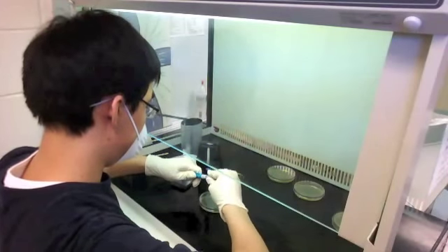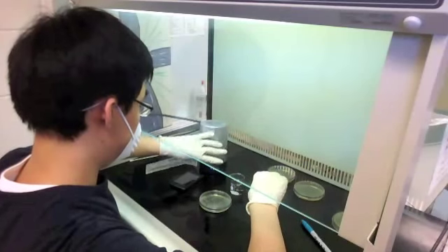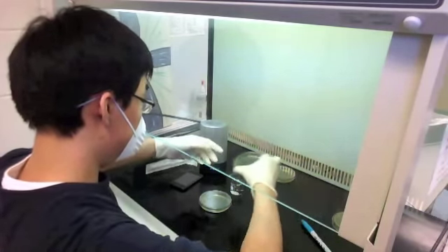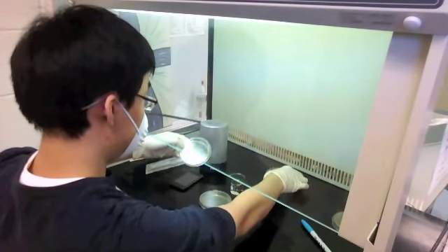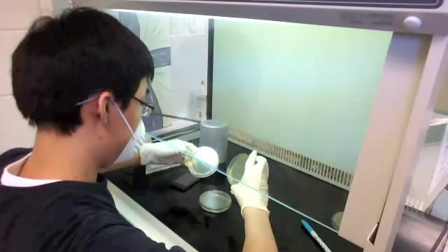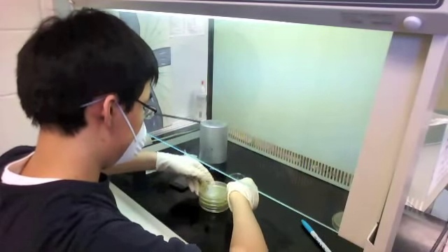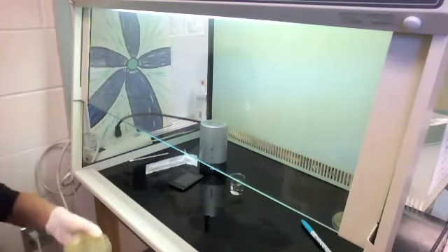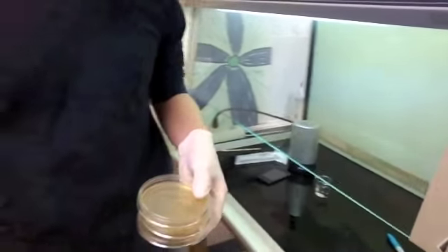Now I'm labeling this plate as the 'after' plate for reference so I can identify it later. Since I'm pretty much done with the whole experiment, I'm taking my time to read the plates, make sure I have the labels correct, see what's on them, and place them in a logical order. Now I'm going to transfer them to the incubator.